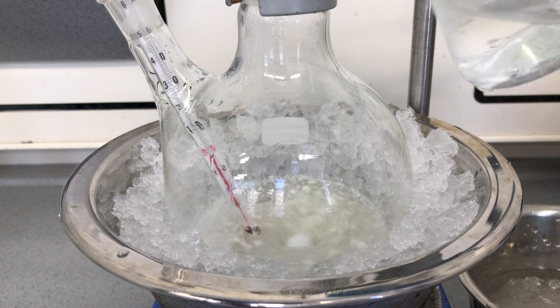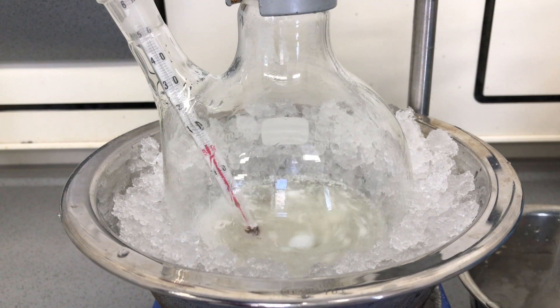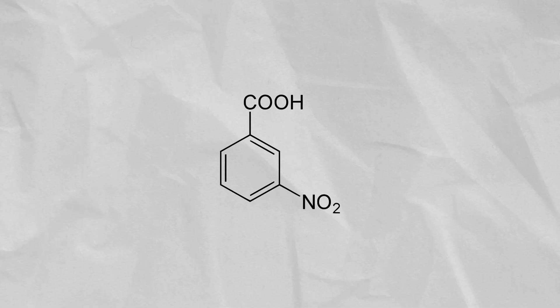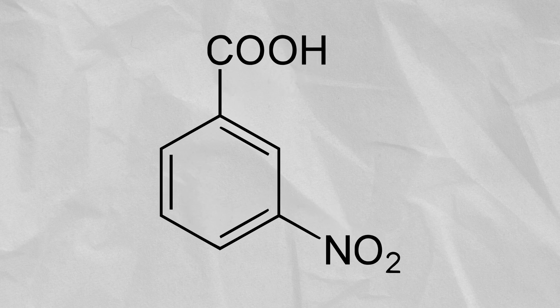The cold nitration mixture was added in portions and again we made sure not to let the temperature exceed 5 degrees C. The reaction of benzoic acid with nitration acid mainly produces 3-nitrobenzoic acid, which you can see here.